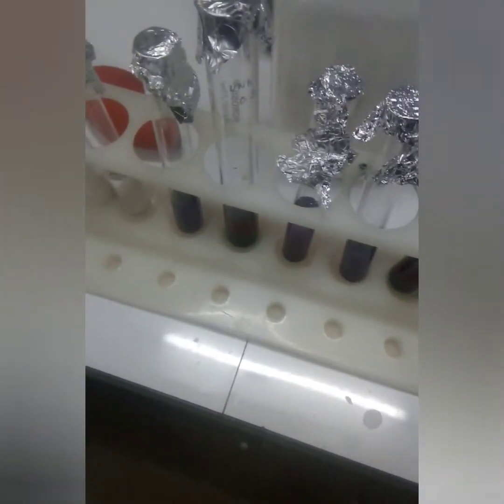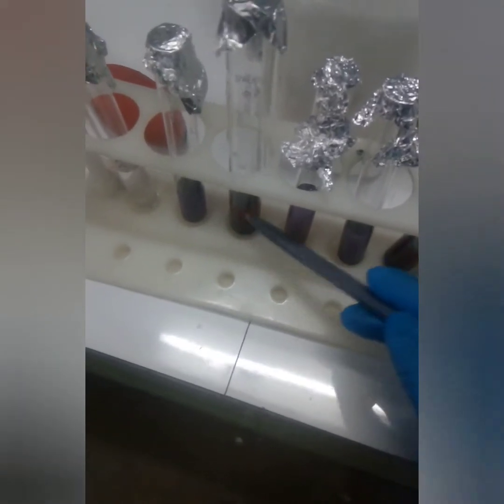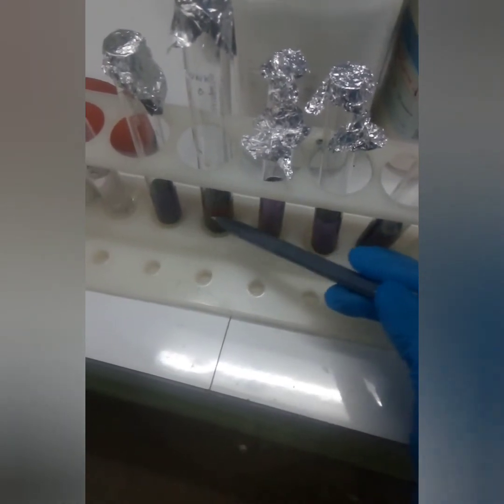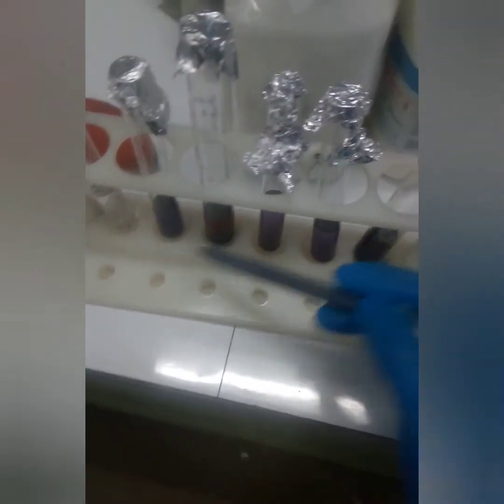Then same thing in the third test tube, we have 0.4 ml amino acid, so I'm going to add 3.6 ml of water to make the final volume 4. In that way, we add distilled water to make the final volume 4 ml.